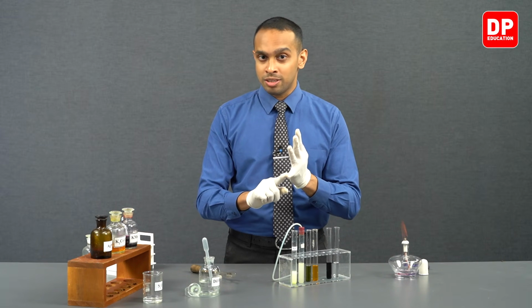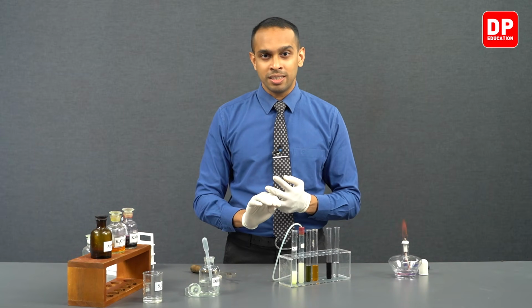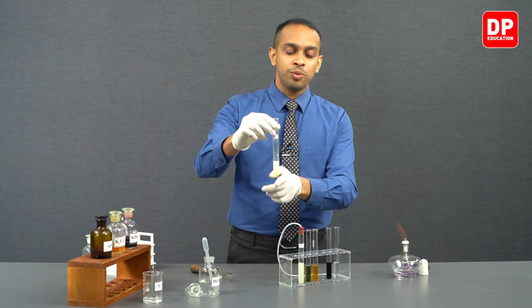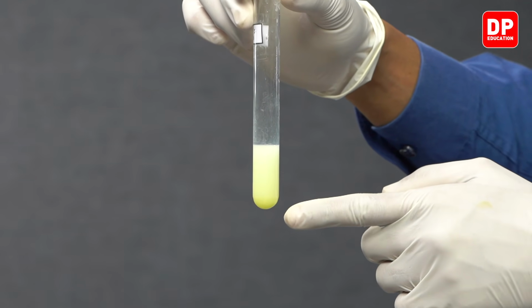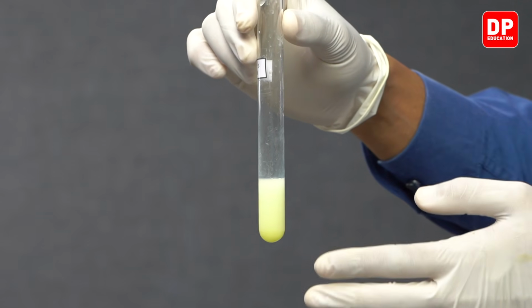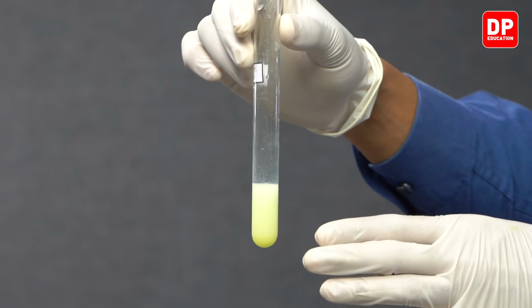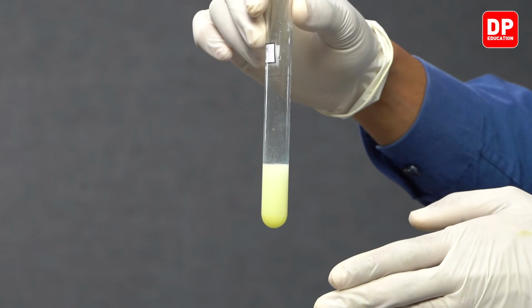The formation of sulfur is very clear through this yellow color precipitate. So we can see a yellow precipitate is readily formed when we add hydrochloric acid to a thiosulfate ion solution. So this confirms the presence of solid sulfur in the medium.